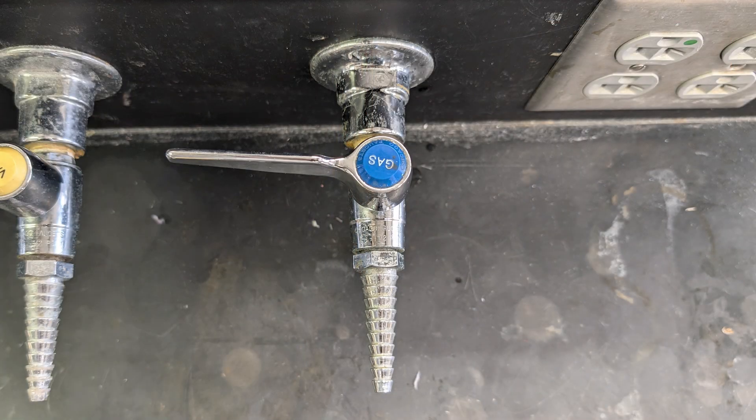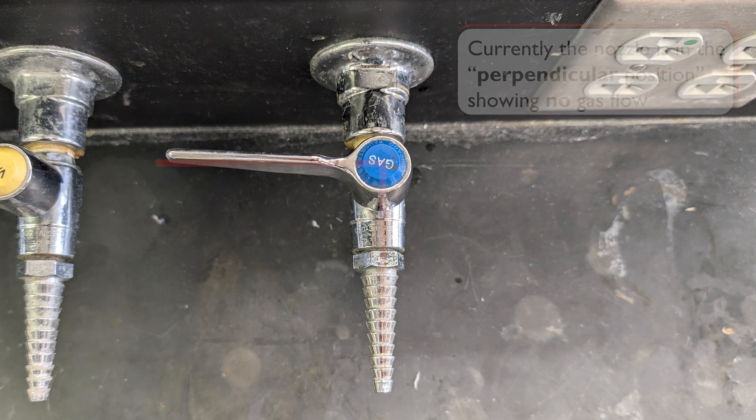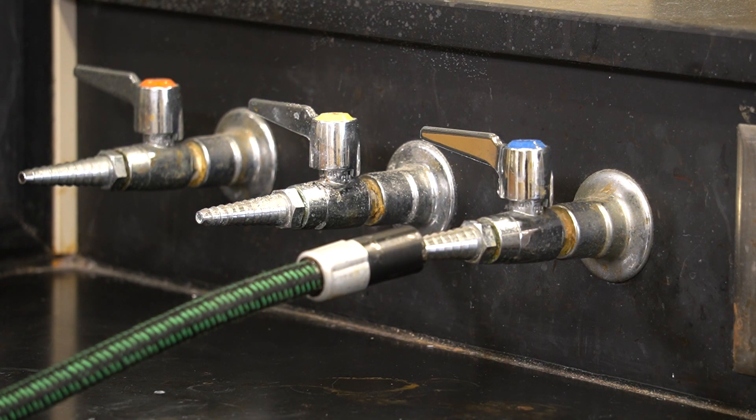At our bench, we have a nozzle labeled gas. This nozzle provides the natural gas that we will be using to produce the flame. We will attach tubing here, which will extend from this nozzle to our burner's gas intake.